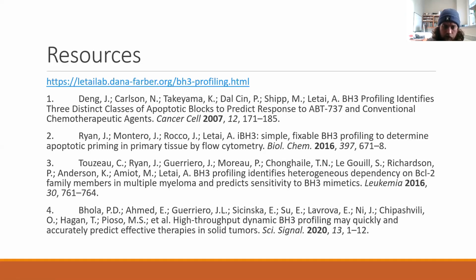I guess I could start with a question if no one else has one right now. Maybe it's a silly question, and it might be too specific. But how does digitonin permeabilize membranes again? How does it act? So digitonin forms, I'm going to blank on the actual chemistry of it, but I think it forms ion channel-like pores in the cell surface membrane. It's not completely destructive, so you preserve your cell shape without actually destroying the cell.